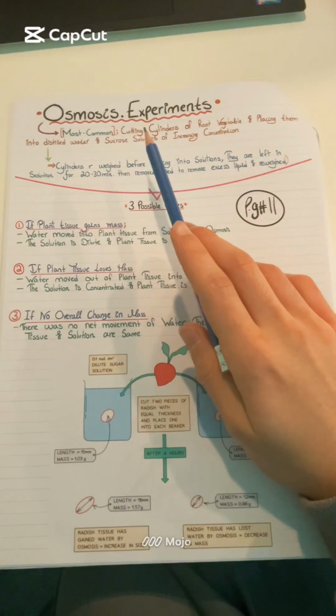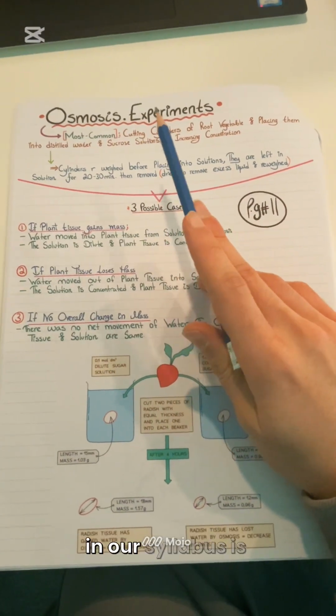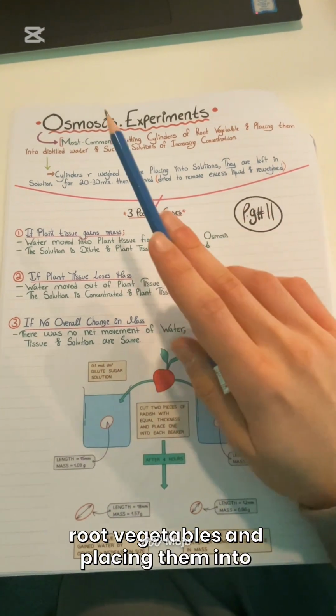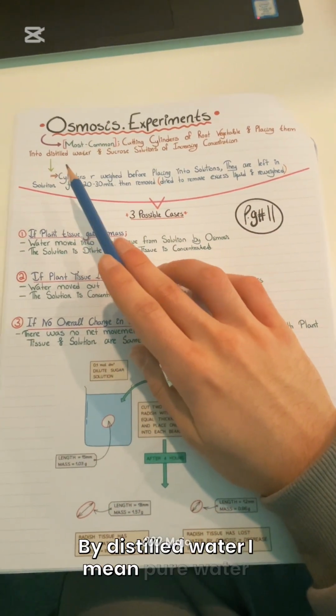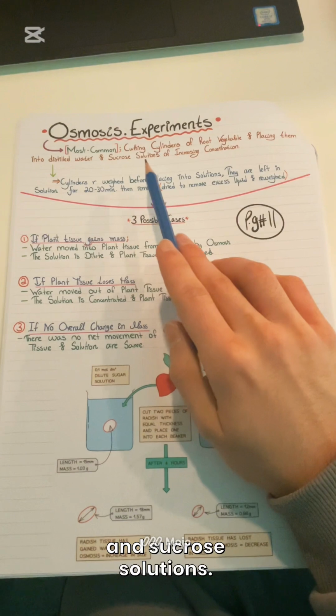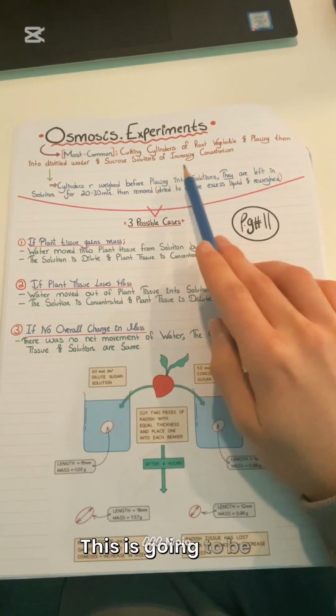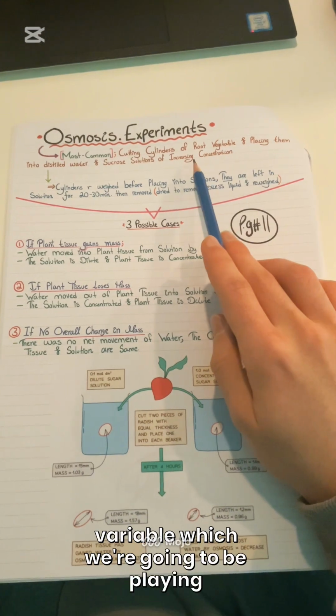Osmosis experiments. Now, one of the most common experiments in our syllabus is cutting cylinders of root vegetables and placing them into distilled water. By distilled water, I mean pure water, and sucrose solutions. Sucrose is a sugar of increasing concentration. This is going to be our independent variable, which we're going to be playing with.